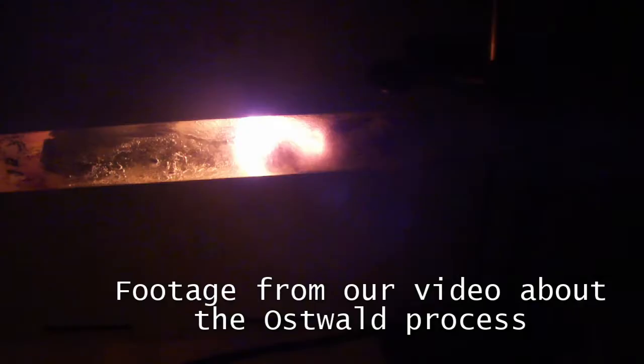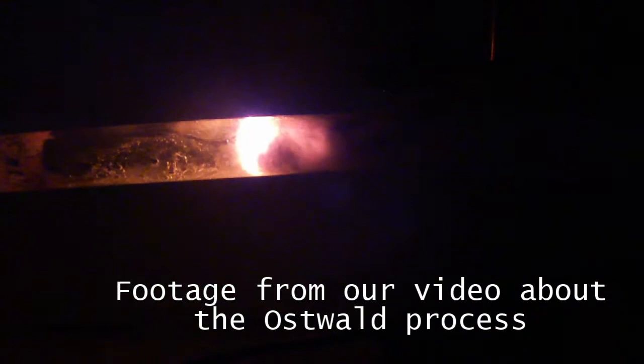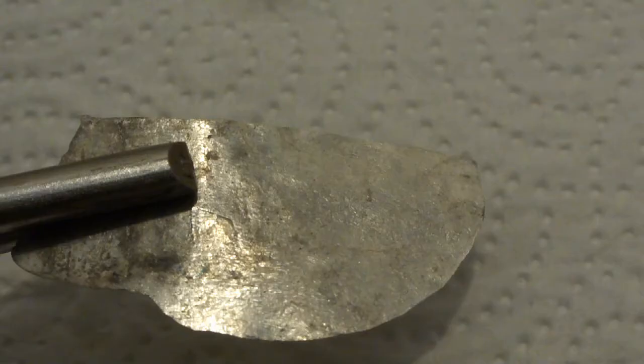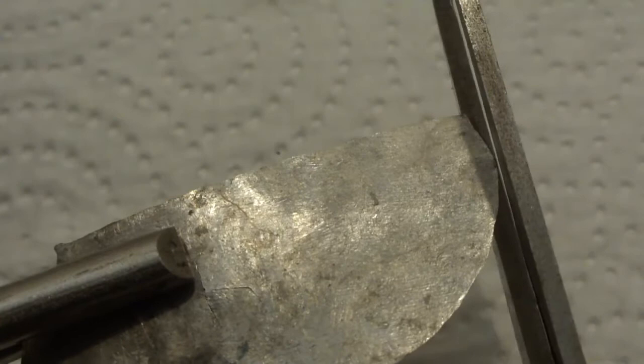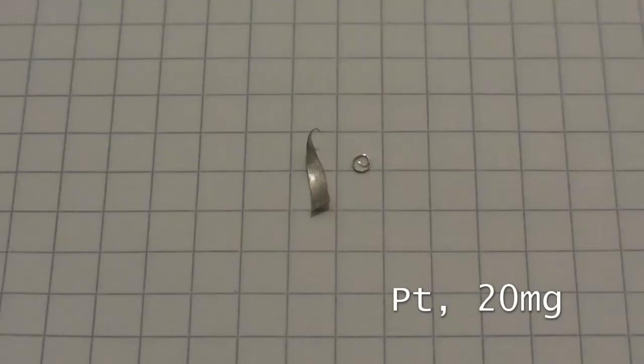Now before you freak out, the amount of platinum required is so little that its value is in the range of pennies or cents. We are using a piece of platinum sheet metal, but you can go to a jeweler and just buy a tiny amount of platinum wire. It won't cost much. We are going to use 20 milligrams of platinum. This is worth about 30 cents. But it is enough to prepare a large quantity of catalyst.